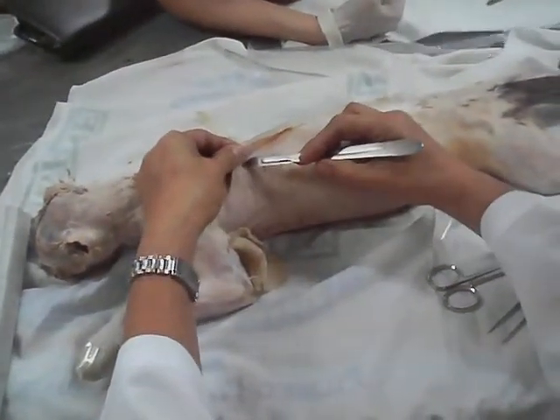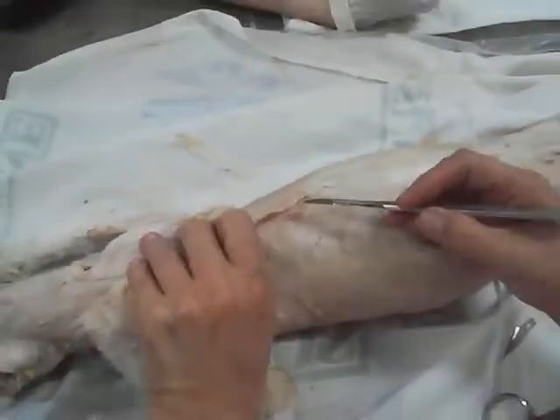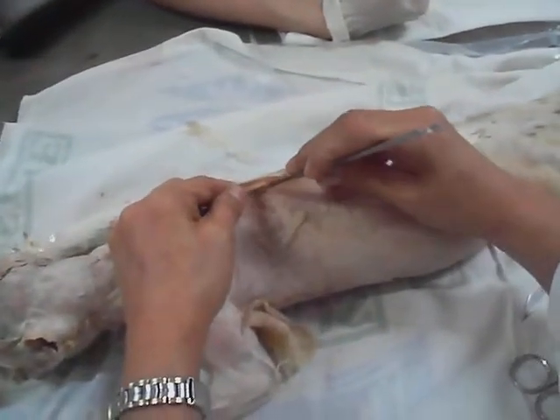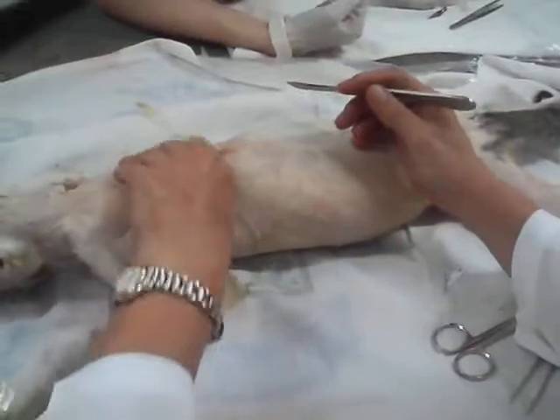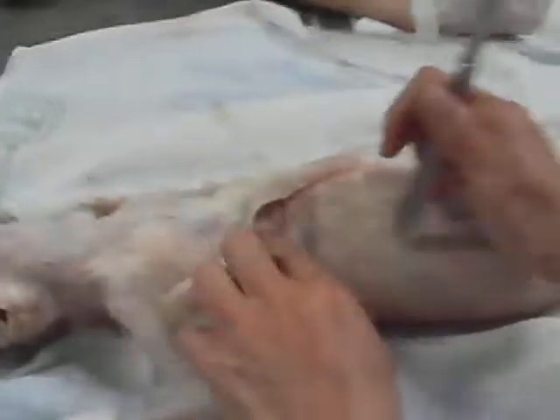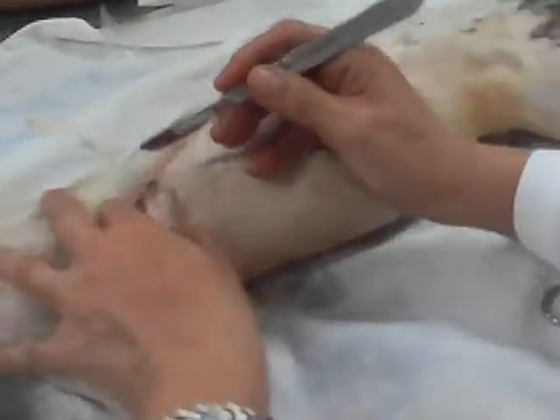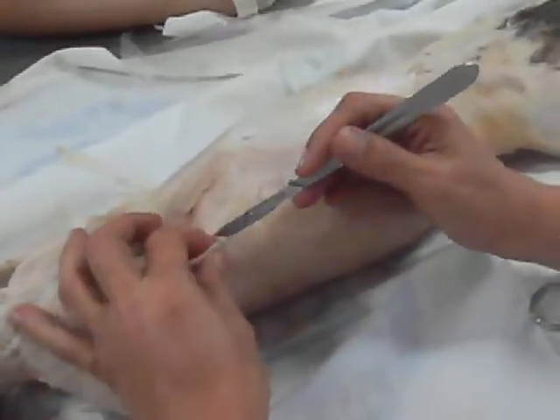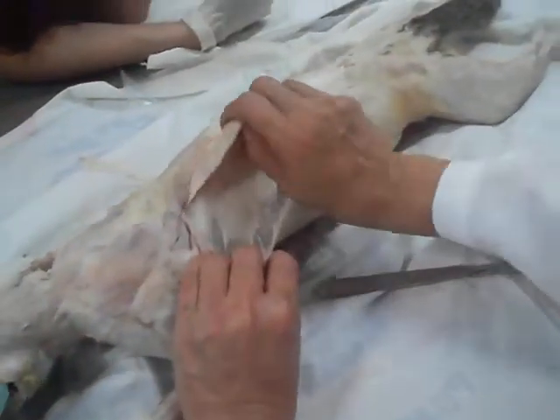So you leave first the spino trapecio, and then after lifting it — there. Cut the belly of the latissimus dorsi. Yes, this is the latissimus dorsi. You have to clean first — there. Latissimus dorsi.